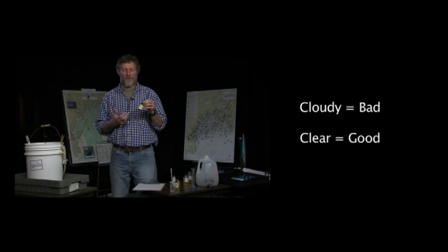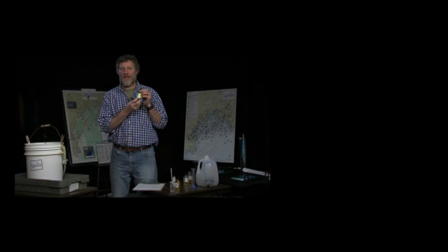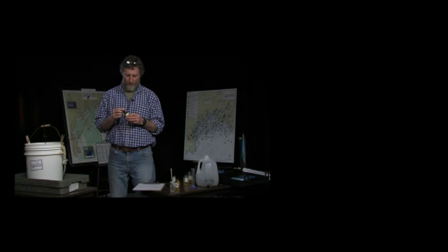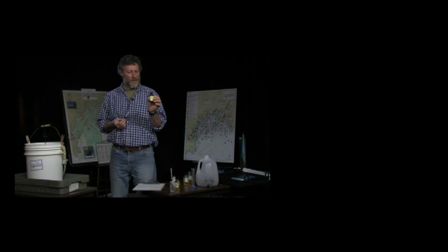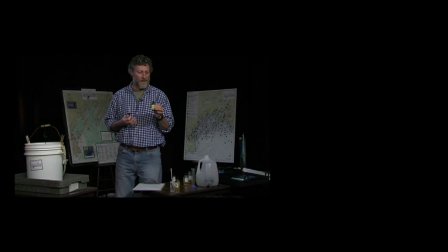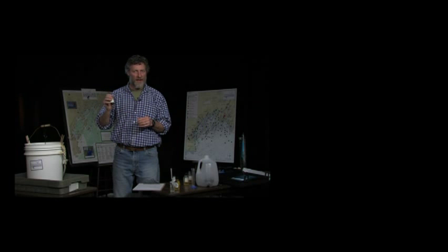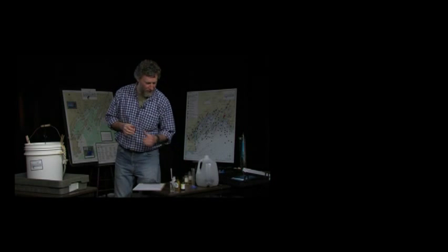The first thing that we would do is, if you called us and you had an issue where your readings were very far apart from each other, is we would have you look at your starch indicator and see, is it cloudy inside there? If it is, then we can either send you a new bottle of it, or you can do a quick remedy yourself, which would be to take the rubber stopper out of the bottle and heat the liquid up in here so that the potato starch inside does go back into solution. And that can be done in a microwave. If you do it in a microwave, you're going to do it for no more than 10 seconds with the rubber stopper off. And then put the stopper back on when it's done and kind of shake it up. And continue doing that until it ends up being a clear liquid.